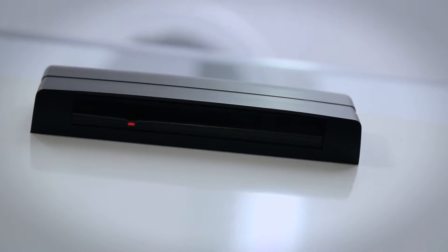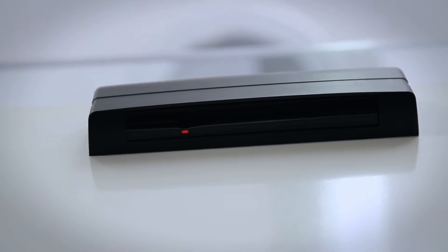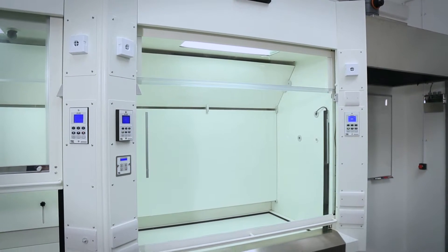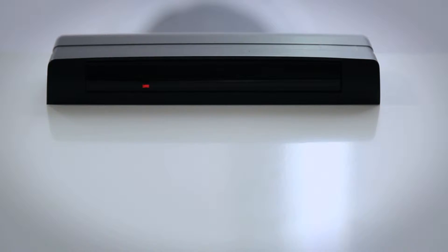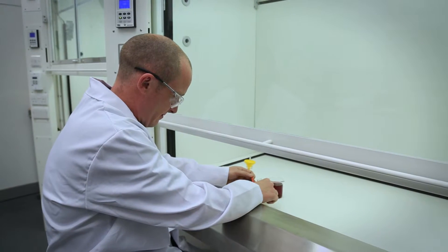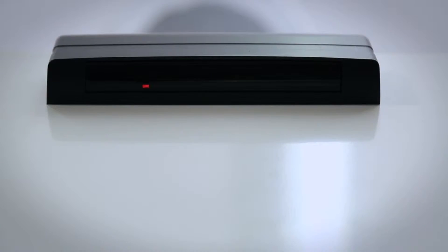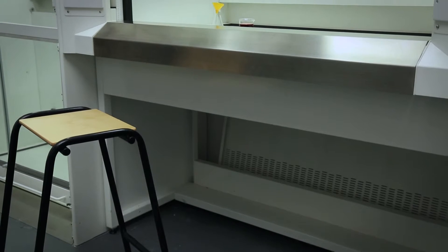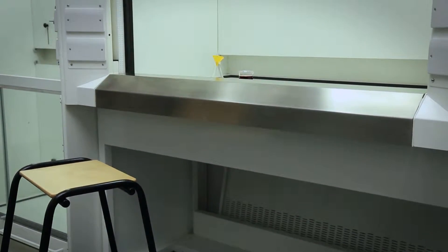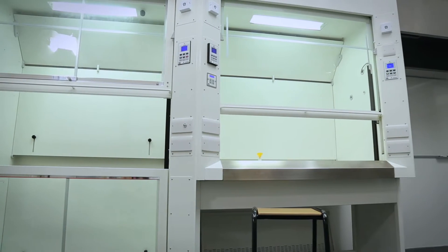This system works through a passive infrared sensor that constantly monitors the work area in front of the fume hood. The onboard mapping facility ensures it will detect the presence of a user without continuous movement. It will also recognize if a solid object has been left in front of the hood for a long period and still allow the sash to close.